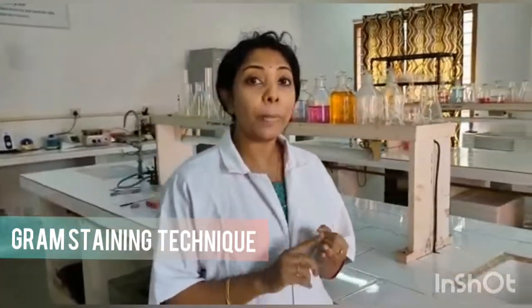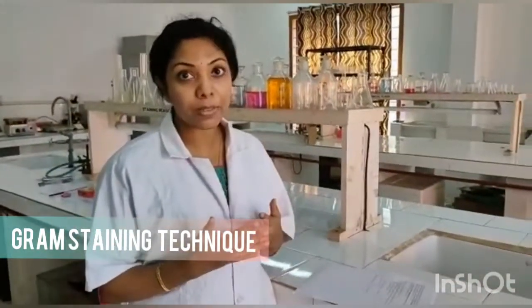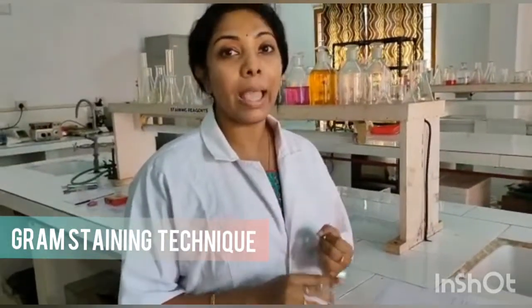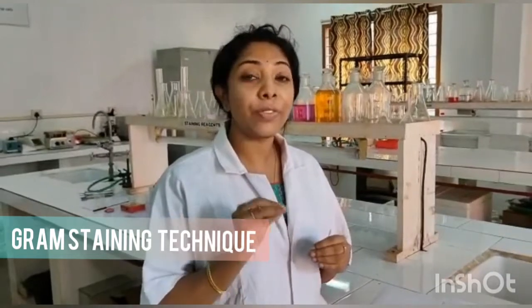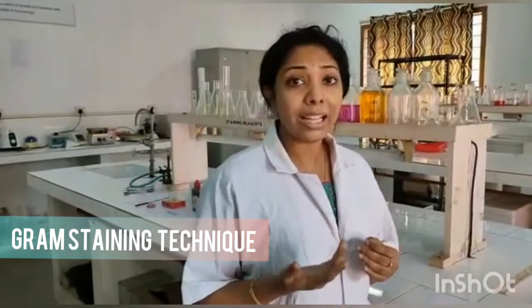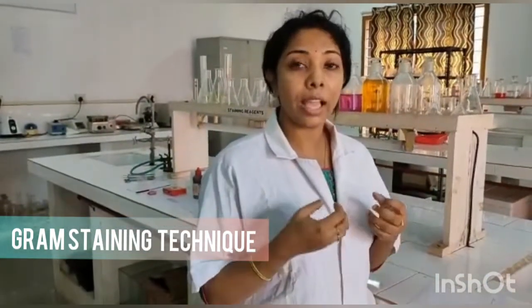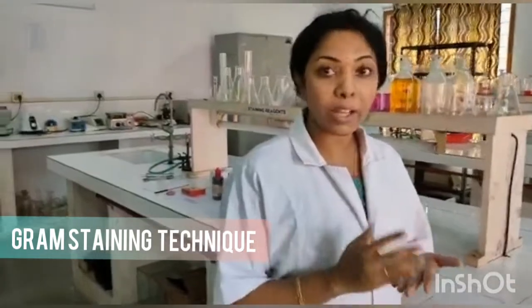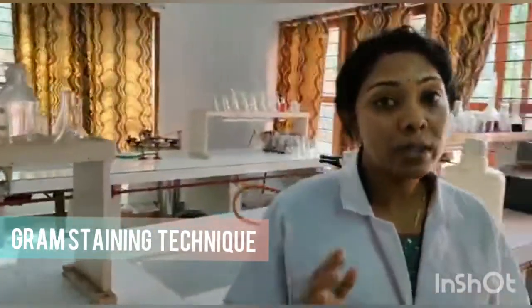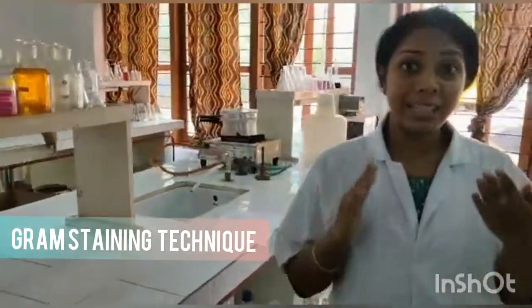There are four major basic steps for the gram staining. First is the application of the primary stain, crystal violet, to the heat fixed smear of bacterial culture. The second step is the iodine application, where the iodine combines with the crystal violet and traps it inside the cell.